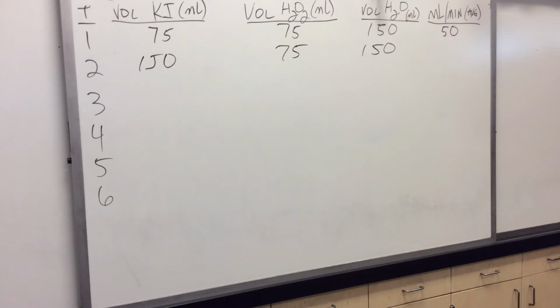The problem here is that because the total volume is not constant, doubling one volume doesn't really double the concentration. It sort of does. This is what students will do. What we really want them to do is make the total volume the same.